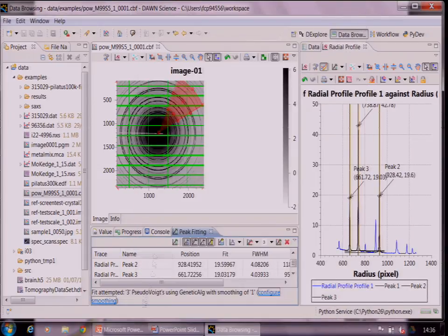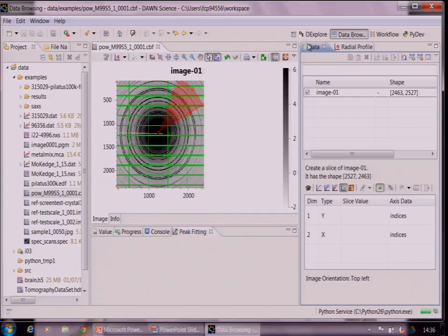Okay, great. So also, all the graphics are done in-house. There's no reliance on a third-party library for charting, for example. We've got a fork of what the Eclipse Nebula Visualization XY graph is now, but we have it from before it was that. So what we need to do is migrate to the Nebula one, and we're doing that gradually. We're using Philip's IWG group to contact the various people involved, and that seems to be working.